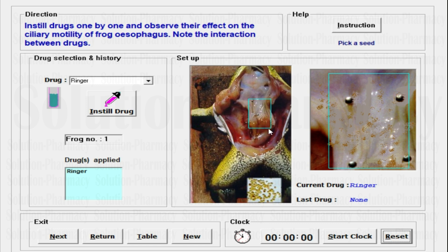Next is the Setup tab. As you can see, there is a frog tied over the experimental dissection tray. On the right is a zoom view showing the esophagus of the frog in an enlarged view. Under that, you will find the current drug name, which is Ringer solution. Last drug was none because we have not applied any drug yet — clearly indicating that no drug has been applied in the past. So this was the basic interface.